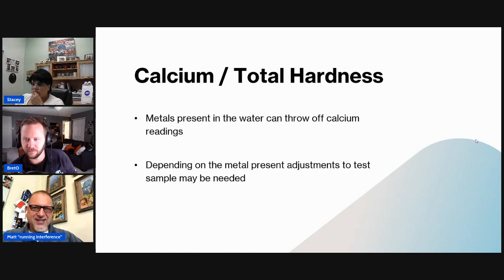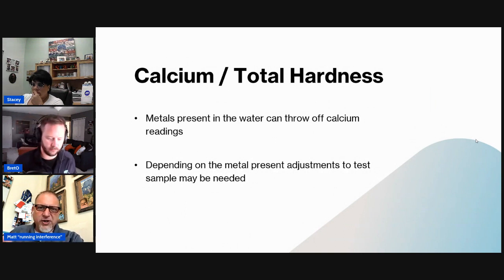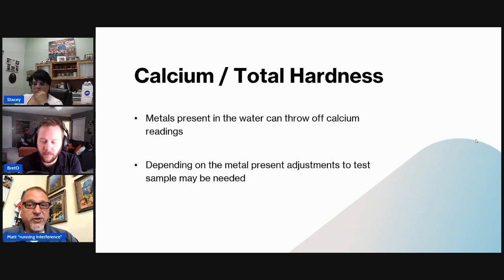So when you're doing a sample or when you're using a test kit, make sure that if it says total hardness or total calcium, that it's testing the right thing. And remember, we were just talking about a second ago, when you're doing a calcium test, typically I think it goes either purple or blue, and if the calcium or the chlorine is high, then it goes pink. And so if it's something not on the comparator color chart, then you know that the chlorine is really high. And you're probably going to know it from other parameters before you even get to this one. But there's really no sense in continuing the test if you know that the chlorine is super high and wreaking havoc with the reagents.